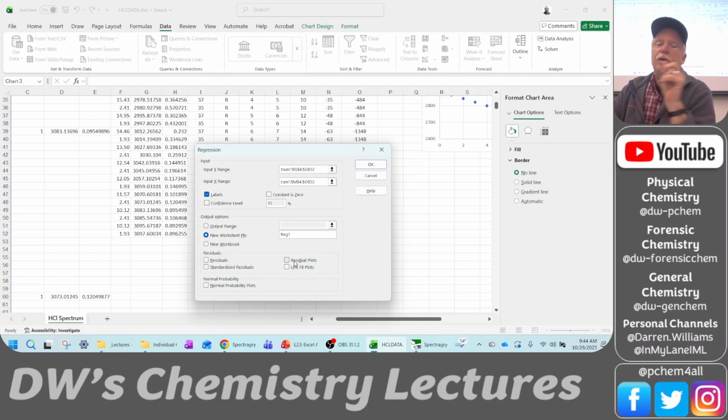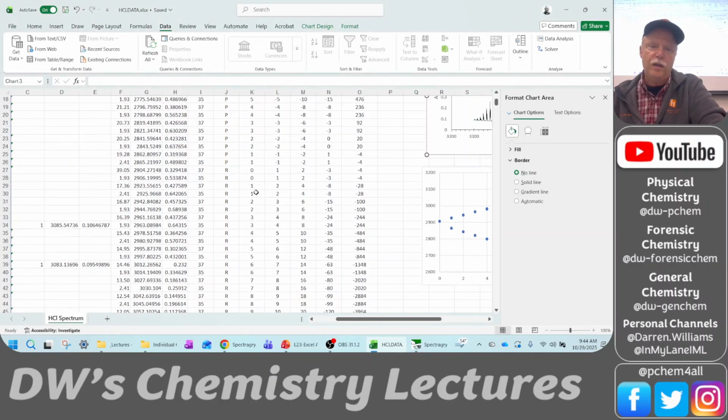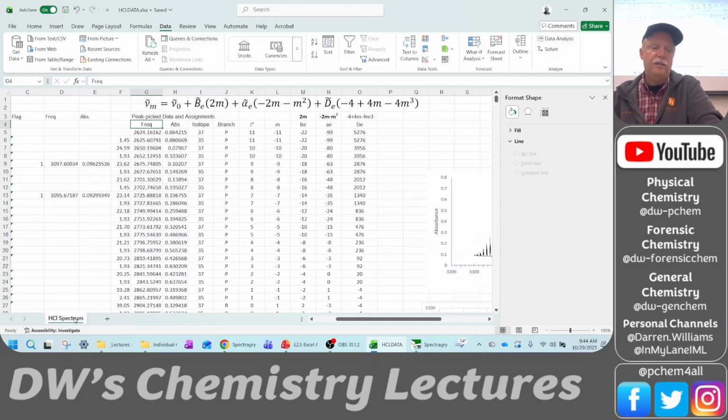Oh, we've got a problem because we've got both isotopes in here. So we would want to sort by isotope and do a 37 isotope and a 35 isotope. So let's bail out of that. You could, yeah. In fact, if you wanted to, you could just control-drag this over and then delete all the 35s, and then control-drag it over again and delete all the 37s. That's a real quick way to make your two tables.